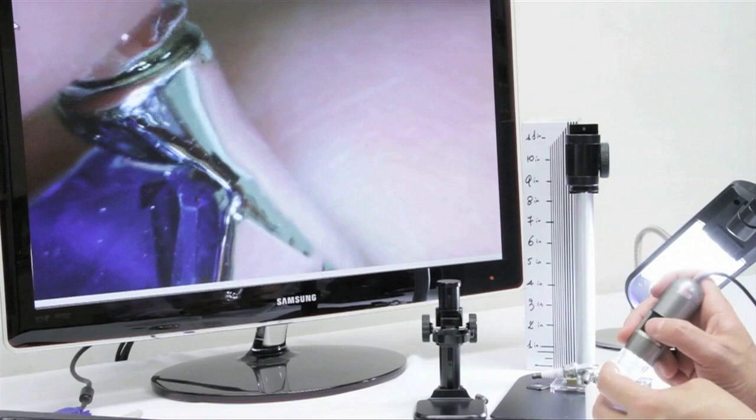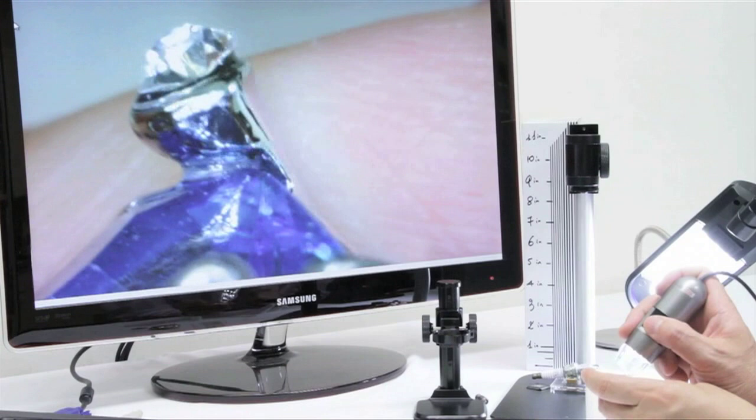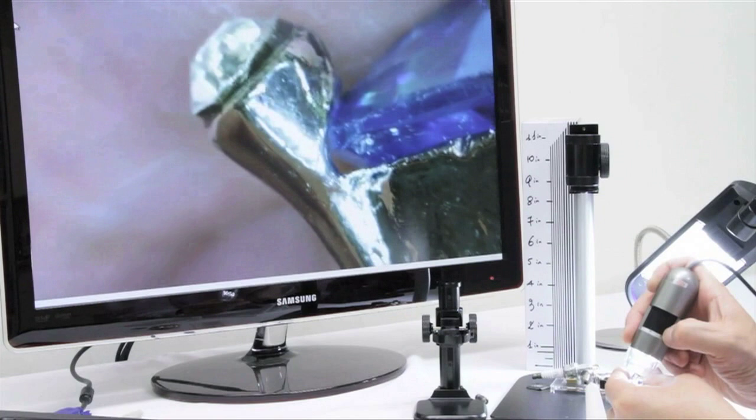Here we're looking at a ring. We can place it in different spots, seeing different parts of the ring for different points of inspection. It has variable focus.